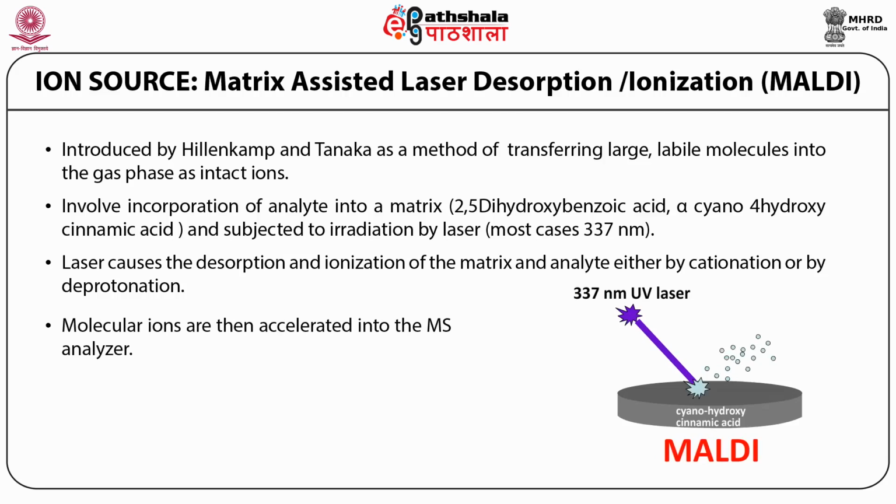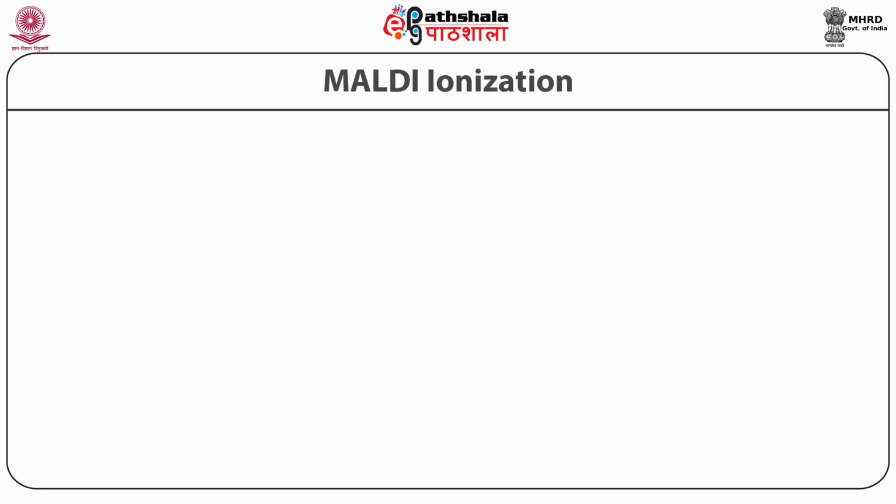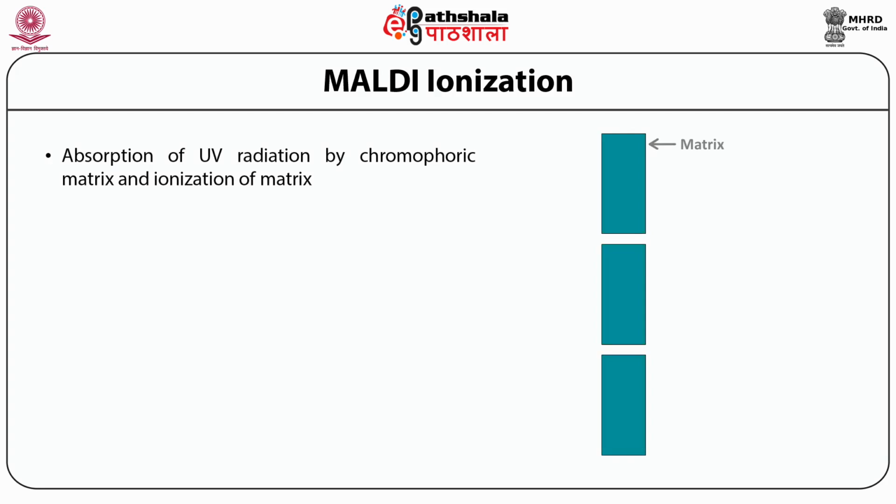Molecular ions are then accelerated into the MS analyzer. MALDI mostly forms singly charged ions and is preferentially coupled with time of flight mass analyzers. The figure shows MALDI ionization, in which UV radiation is absorbed by the chromophoric matrix and this matrix is ionized.